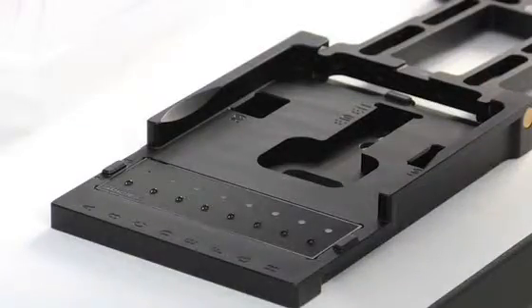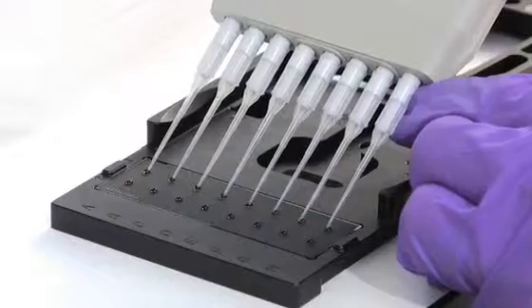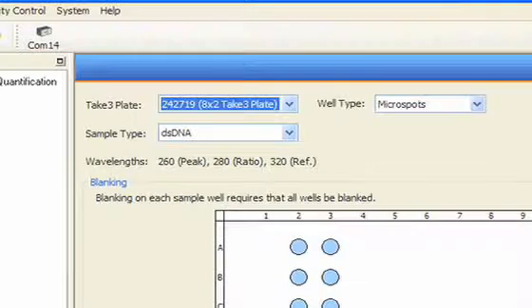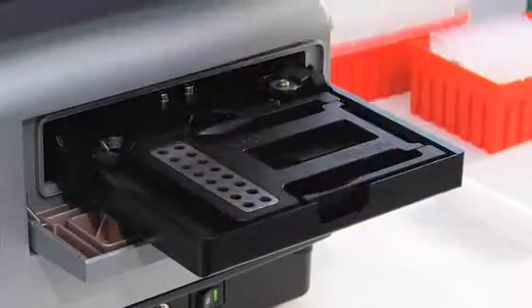We'll use an 8-channel pipetter to place our blanks and DNA samples on the Take-3 plate. Open a Take-3 session in Gen-5 and select the sample type — either single or double-stranded DNA. We're using double-stranded DNA samples, each with their own buffer blank, so all microspots will contain blanks.